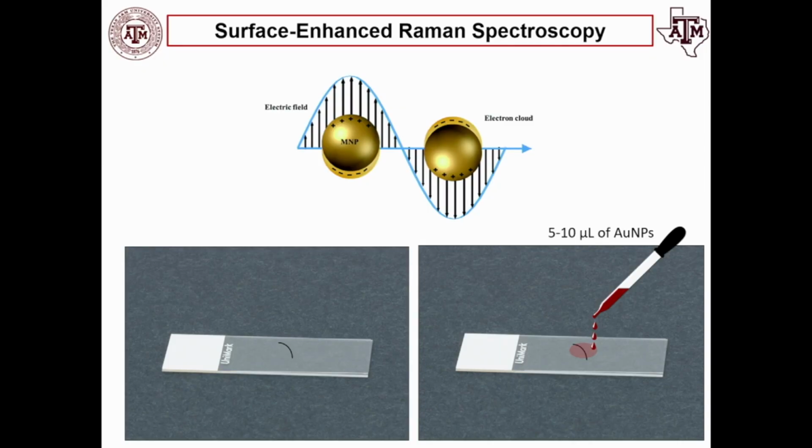Raman just doesn't see information, doesn't see the signature from dyes, and I'll show it to you in a second. Infrared spectroscopy primarily probes the bulk volume of the hair, and the signal therefore is dominated by vibrational signatures of keratin. And fluorescent techniques are great and nice methods, just again, not enough dye signal contributes to the spectrum, and therefore we cannot have robust and reliable information about dyes present on hair.